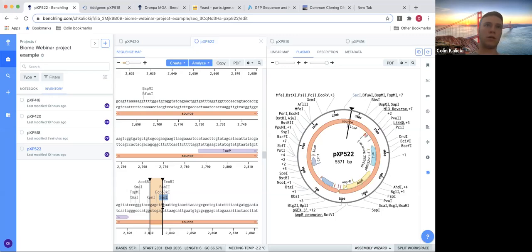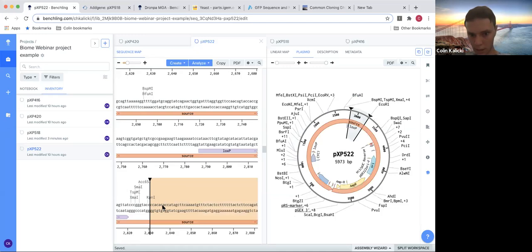Another way to do it is to leave the cut site in and tell them. You'll tell the company what cut site you're using, and they'll be able to know. So I'm going to just erase it and make sure we put it in our notes later. If someone can remember that we did SacI or SacII, that'd be great. So put that in. Now we put this in.